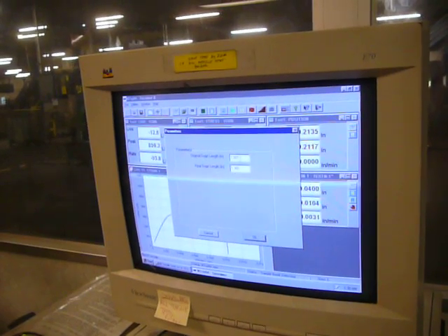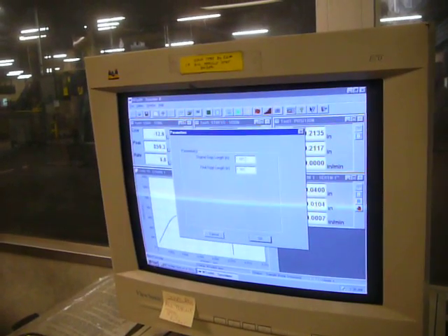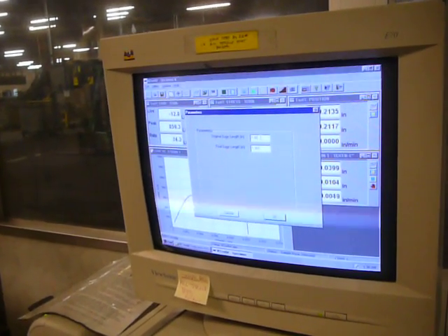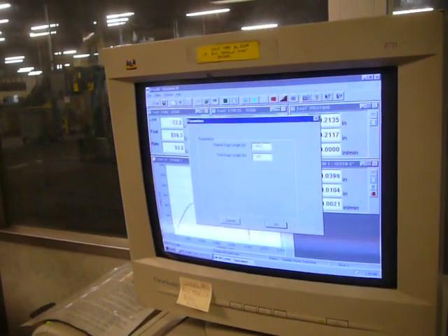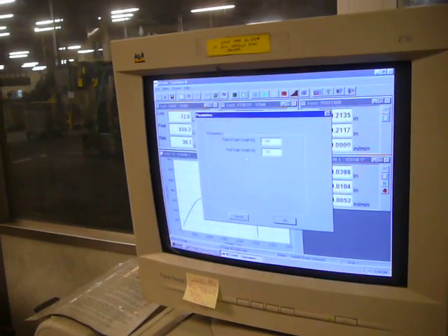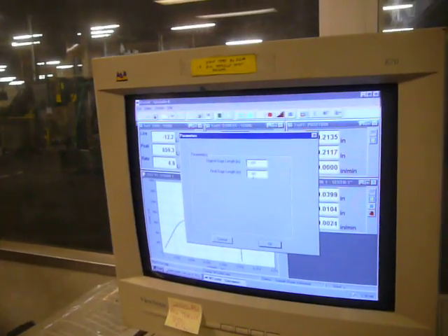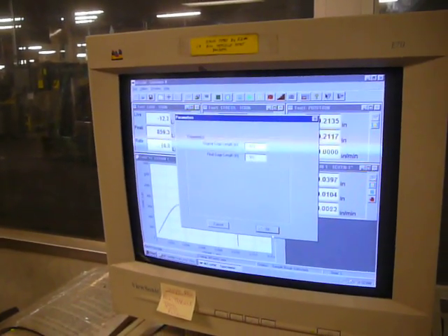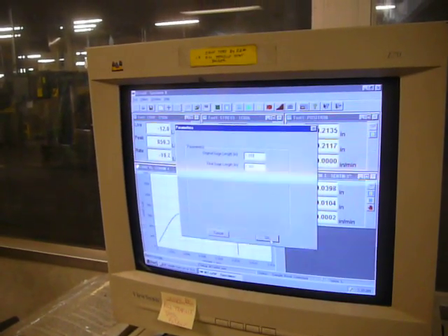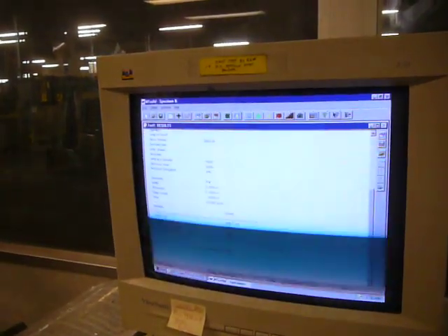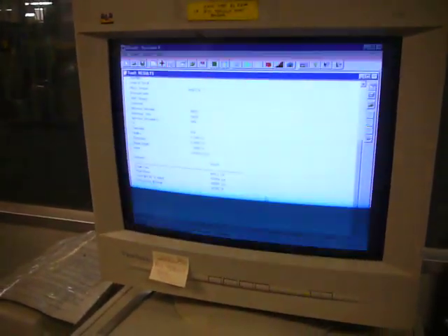And we use the one inch gauge length. And you record your final stretch. And then press okay. And then there's your result.